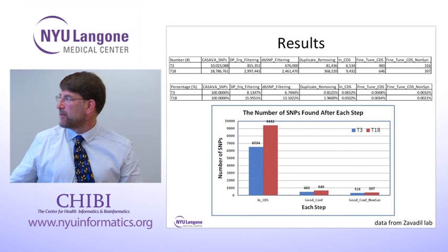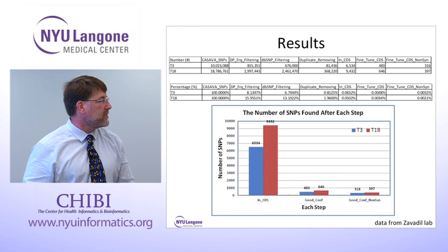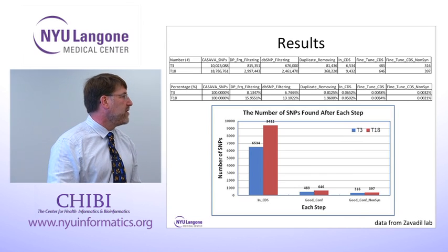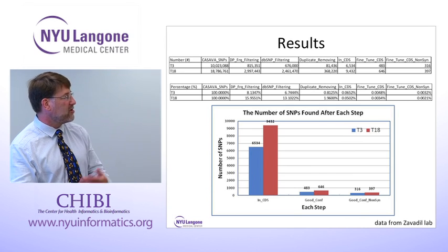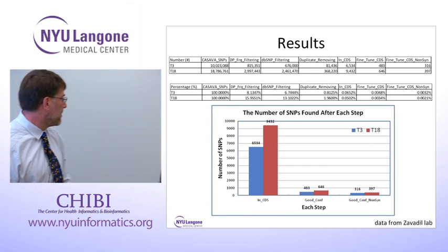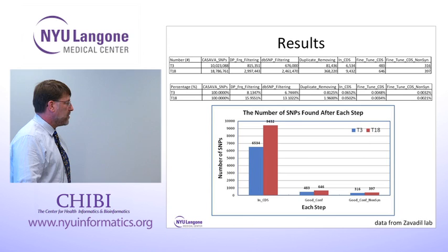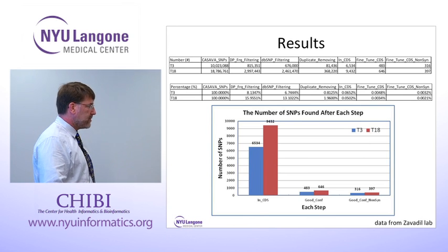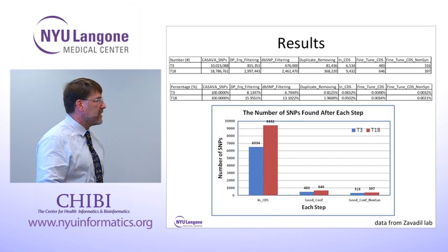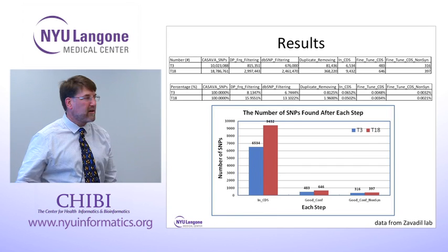So the good thing is, you could pick 20 or 50 of these and test them somehow and get a reasonable idea. If you had 100,000, then you wouldn't feel confident picking a few and testing them because you know most of them are false positives. It's really complemented in the study with genome survey. Like exome type sequencing? Yeah, all DNA. Yeah, we've seen the same pattern with the exome data as well. It's just a matter of setting your thresholds here for what you call a good confidence.